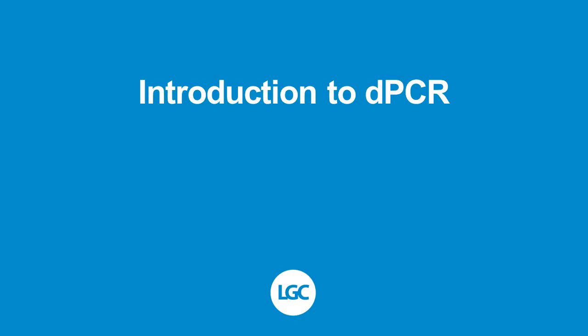In the following section, we will provide an introduction to the digital PCR technique, give examples of applications to which it can be applied, mention some advantages and limitations, and give examples of the platforms and instruments currently available commercially.